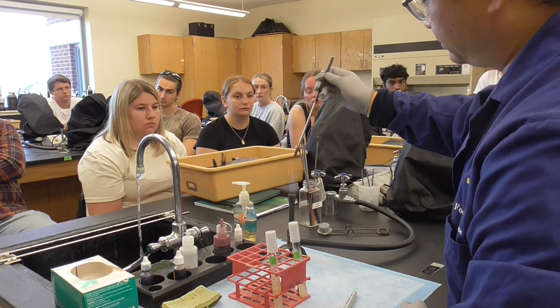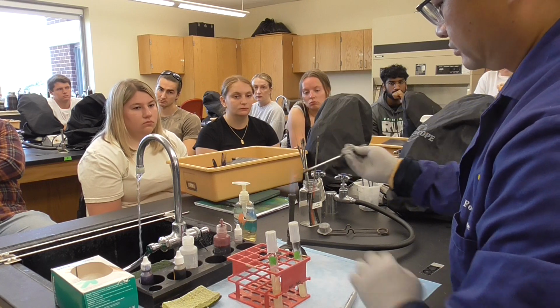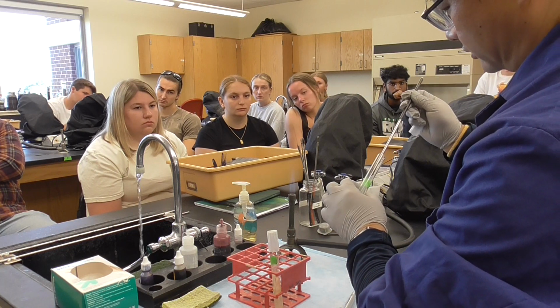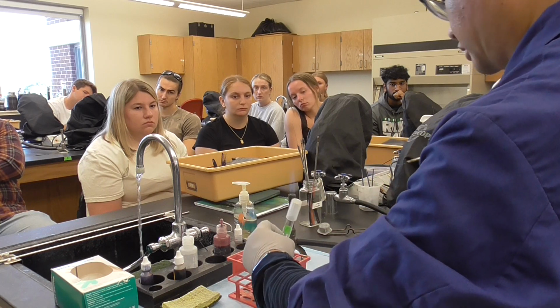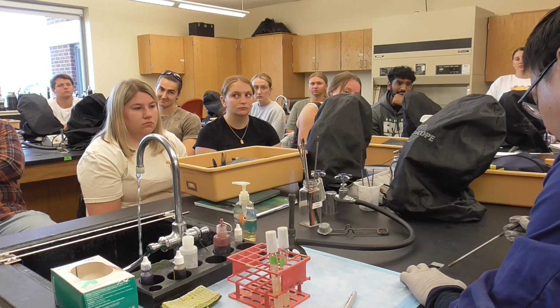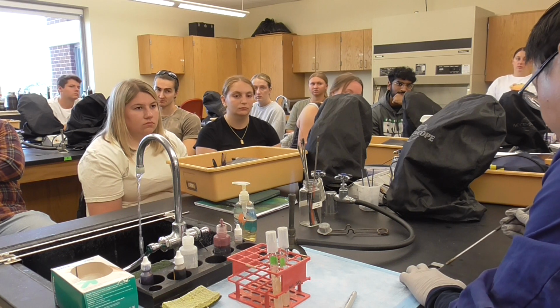Okay, flame the loop. And we're going to do lactobacillus. Go down. Don't block it. I saw that some people damaged it last time. That's not very nice because we have several labs until 4:30 in the afternoon.